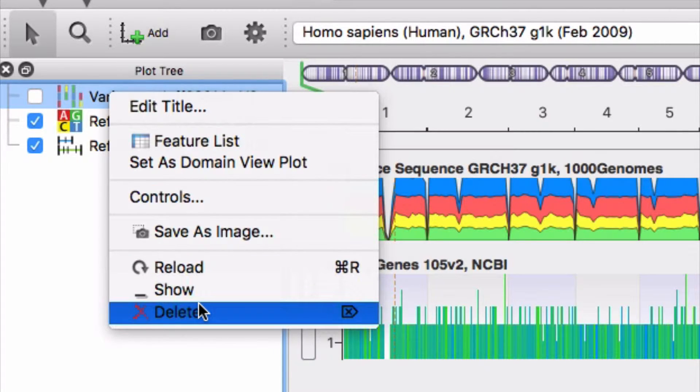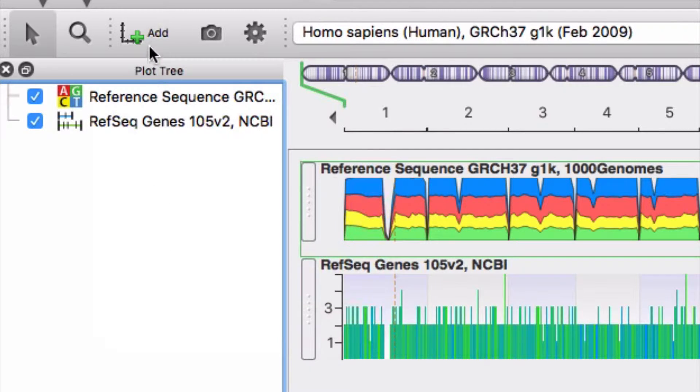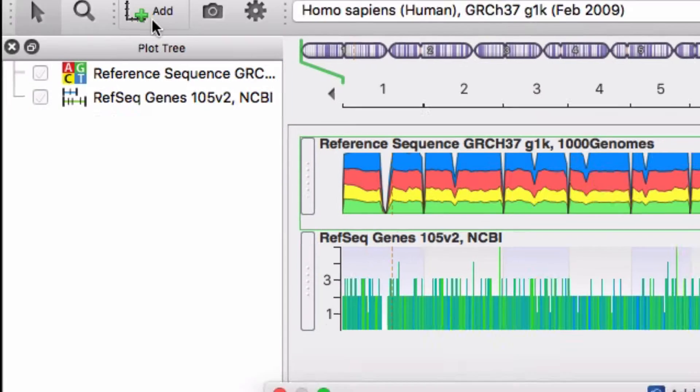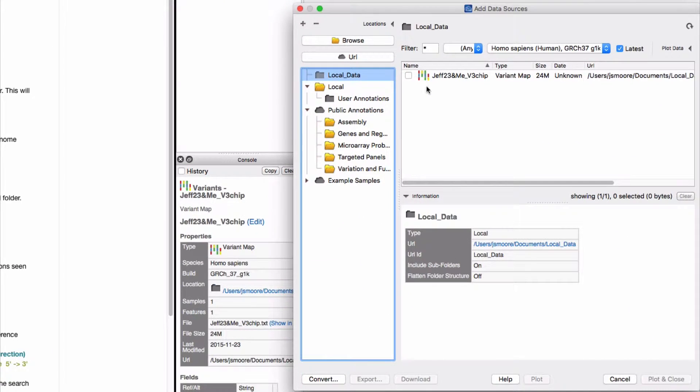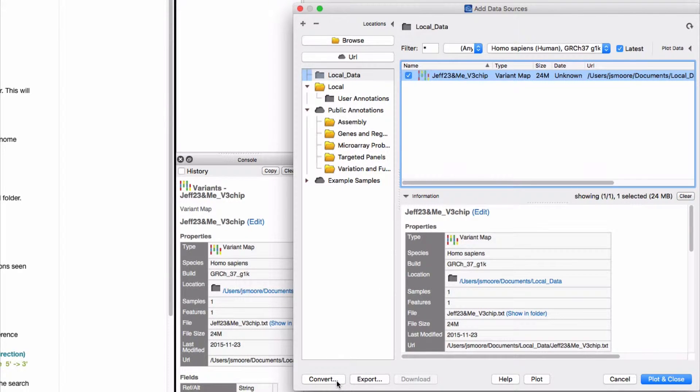To do so, right click on the track's name and select delete. Return to add data sources. Again check the box next to the raw data file, but this time select convert.